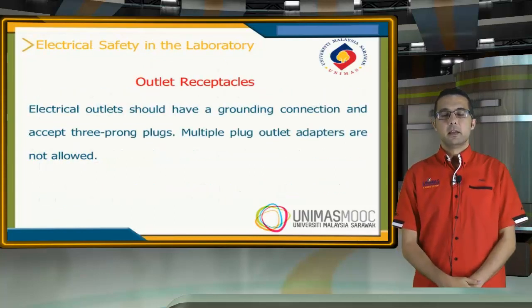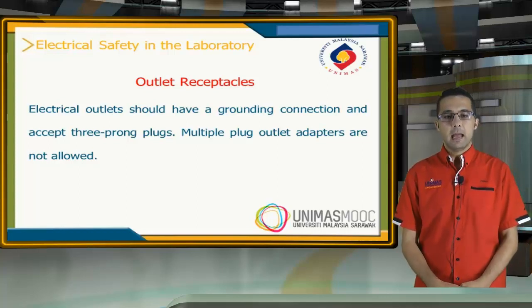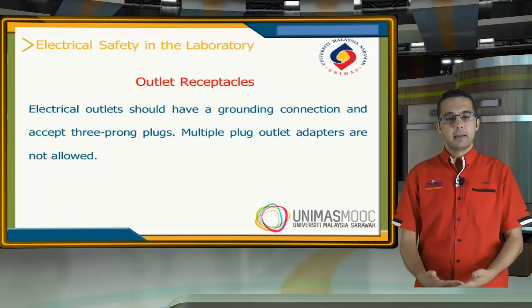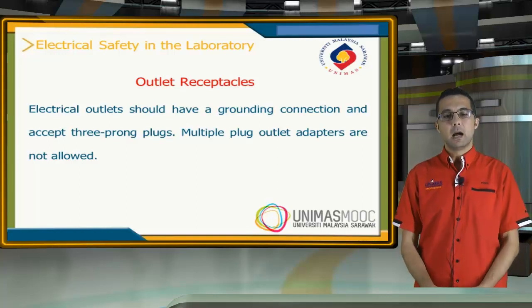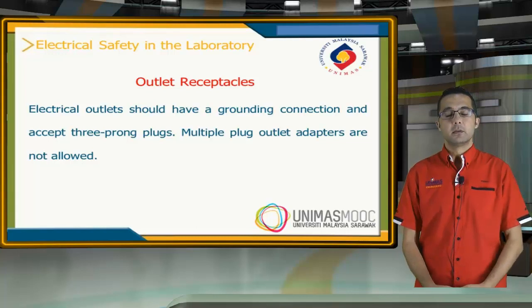The electrical outlets in the lab should have grounding connections and also accept three-pronged plugs. Multiple outlet adapters inside the lab are not allowed.